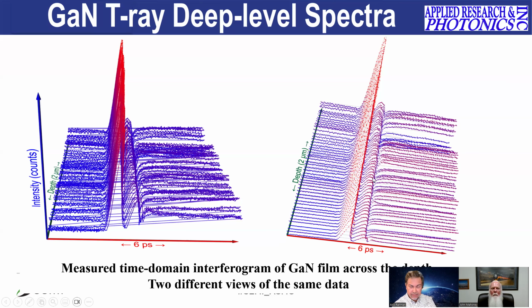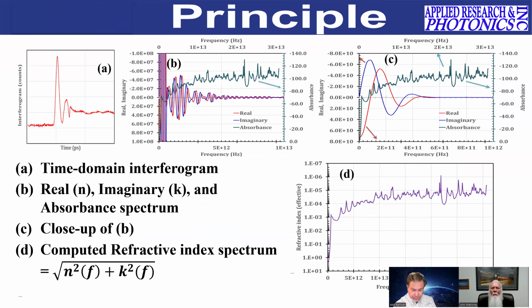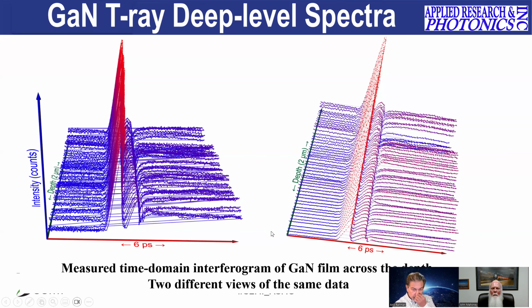The intensity axis is not shown here, but this is the intensity axis, and we're going deep into the sample at every 50 nanometer in this experiment. And then we want to see how the surface chemistry or whatever has happened in the subsurface, is there anything change inside the thickness of the sample? And the samples are 2 micron thick that we knew.